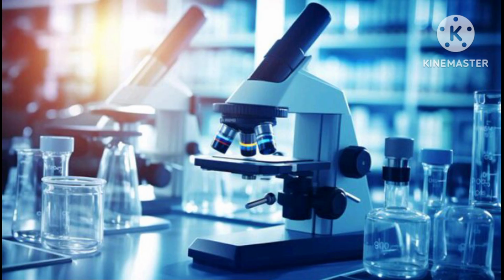A microscope may provide a dynamic image, as with conventional optical instruments, or one that is static, as with a conventional scanning electron microscope. The magnifying power of a microscope is an expression of the number of times the object being examined appears to be enlarged and is a dimensionless ratio.